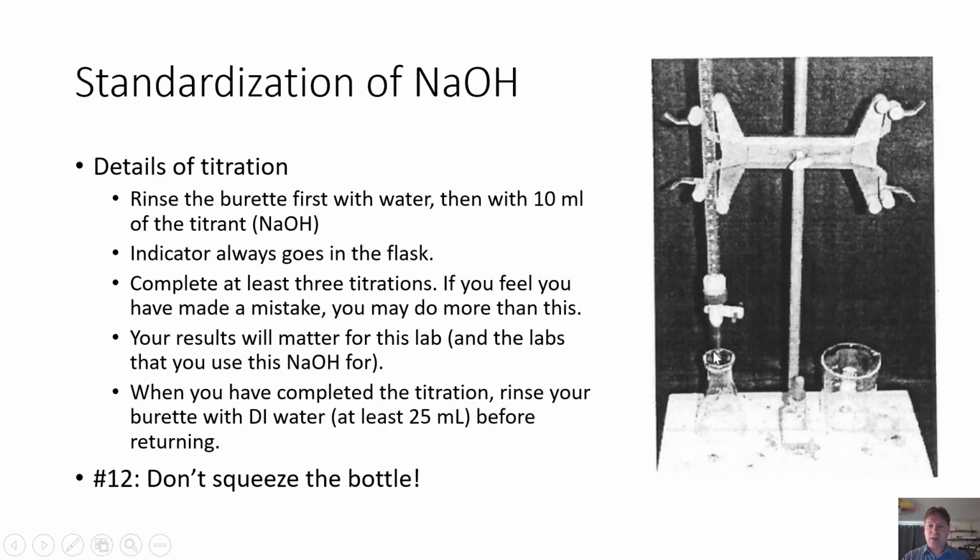You'll have, there's a picture over here, and this is from your lab. Feel free to either take a picture of this and put it in your lab notebook or draw a picture if that's helpful for you in terms of remembering what things are. This larger thing with the large base and the long metal pole is the stand, sometimes called a ring stand. We're not using a ring in this case. These are not in your specific lab drawer, so this is something that you would be sharing with perhaps students from other lab sections. And then there is what's called a burette clamp that we put onto that ring stand.